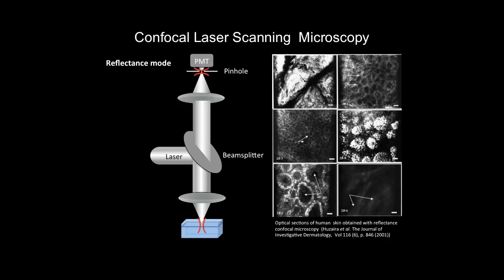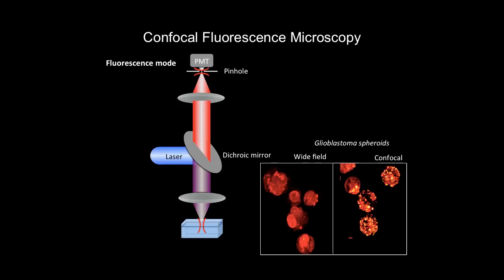So I was mentioning the improved spatial resolution with this technique, and in order to understand about resolution and other aspects of these technologies, we really need to understand the image formation, how the image is formed in a microscope, and really to understand how the image is formed by a microscope, we need to understand how the microscope treats a point source.